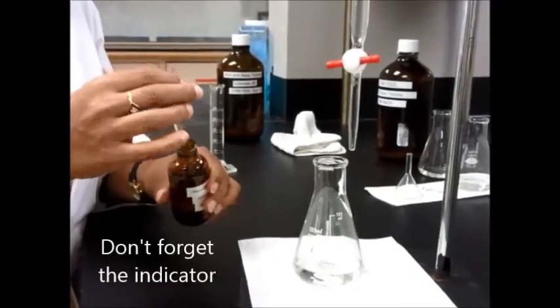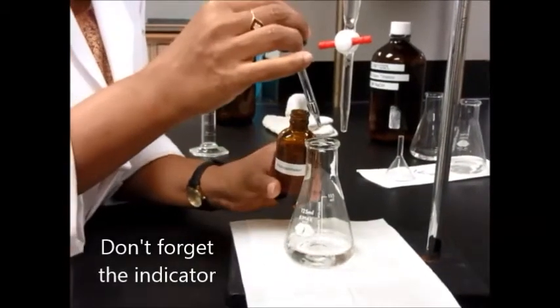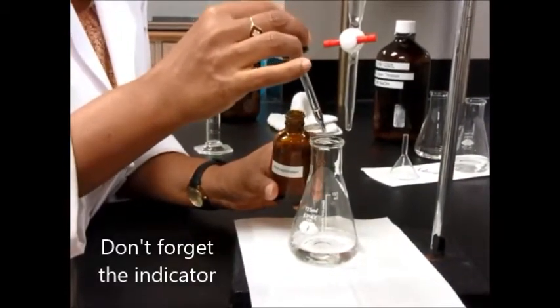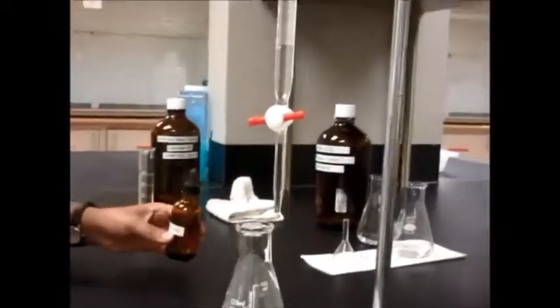For an acid-base titration you will most likely need some sort of an indicator. For this one we're going to use phenolphthalein, which gives a nice pink color in basic solutions. That will tell me that I've reached my endpoint in the titration.